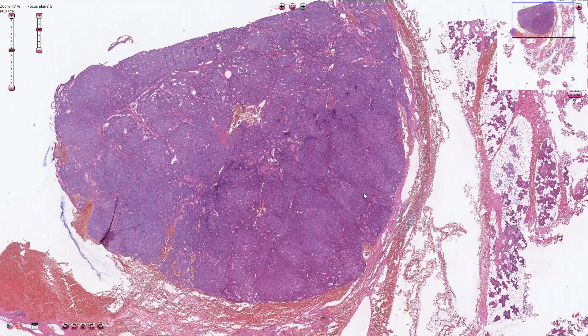The tumor is composed of multiple growth patterns. Here we can see the solid pattern, and here we can recognize the trabecular type of growth, or trabecular pattern.